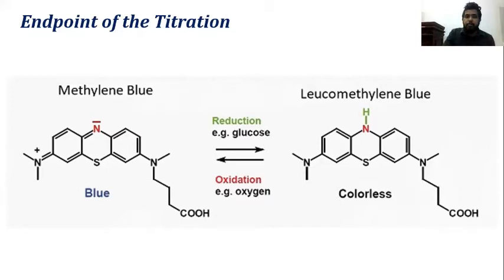And also we have to provide heated conditions in this titration. One thing is to prevent methylene blue forming again by reacting with oxygen.